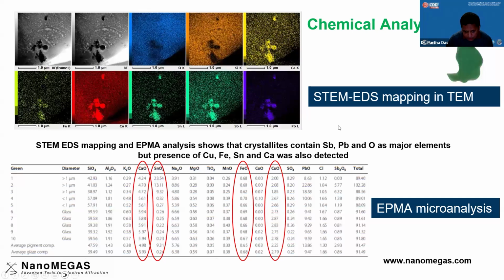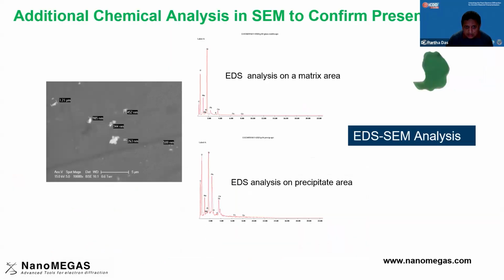Once we have the chemical information, which is always crucial, then we can do something more. One point is that when we were analyzing the sample, as you saw in the EDX, we saw some copper signals, but we are not sure where this copper is coming from exactly, because in the FIB lamella we prepared, there was copper. Actually, you can prepare a FIB lamella without copper, but we realized after the preparation that there were copper signals, but we do not know where this signal is coming from. Is it from the lamella itself or from the support?